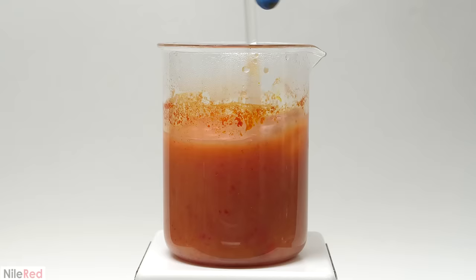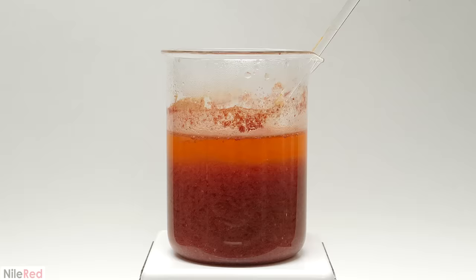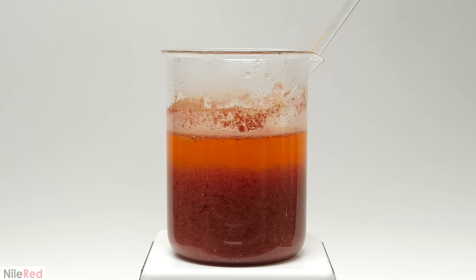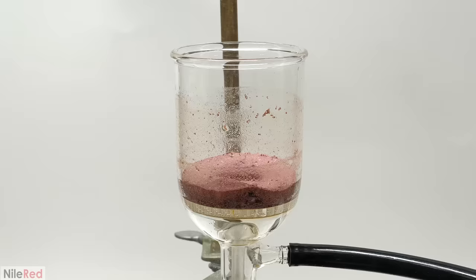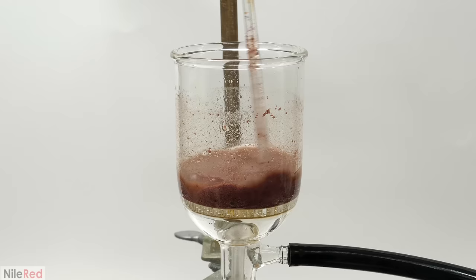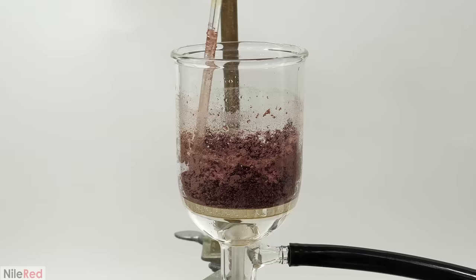This process didn't happen instantly though and the product just slowly crystallized out over the course of about 10 minutes. When it looked like it was done it was time to get rid of all the water and I did this by vacuum filtration. So I turned on my vacuum pump and started adding the mixture. When everything had been pulled through I washed the beaker and the powder with some more water. I was eventually left with a reddish brown semi-dry powder but it was still really impure.